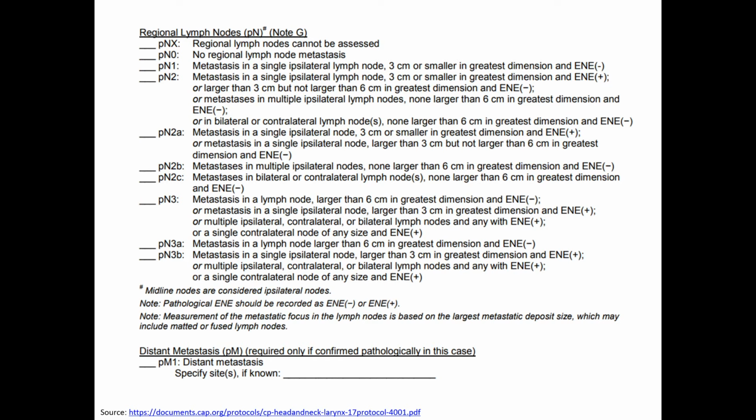That being said, for lymph node staging, the numbers to remember are 3 centimeters and 6 centimeters. If you're going to sample a lymph node, it's helpful if you tell me the size. You guys always give me a range. That's very helpful. If you just tell me representative sections of largest lymph node, because clearly it's positive, I can see that it's positive. I just need to know the size. My advice is 1 section per centimeter of lymph node, especially if it's 3 to 6 somewhere, or a larger lymph node.